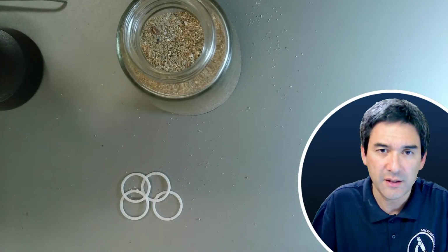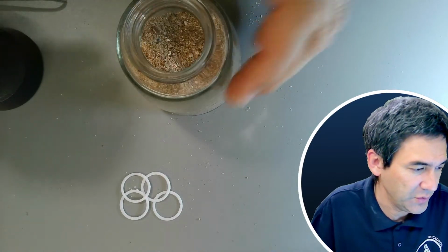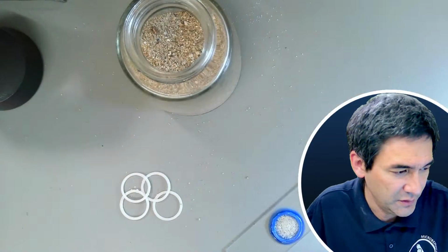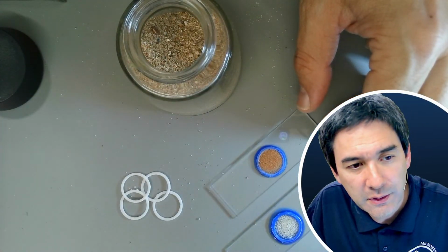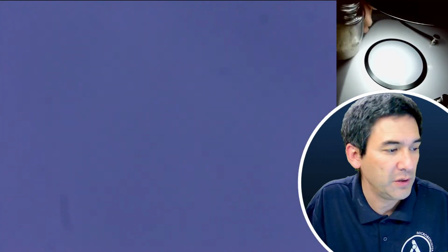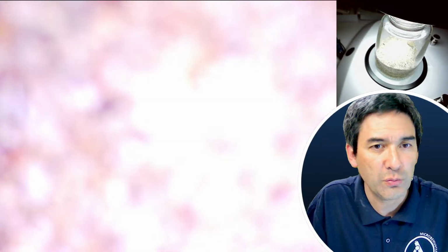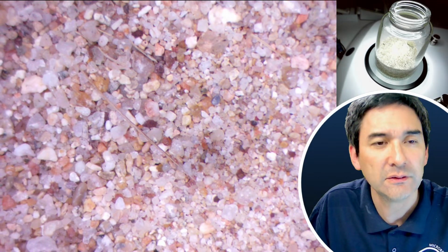Cannes, southern France. Okay, year 2001. Where's the stereoscope? Okay, so that is French sand. I'm just going to put it directly in here, and I have to, of course, zoom out, and I'm going to go up a little bit here.